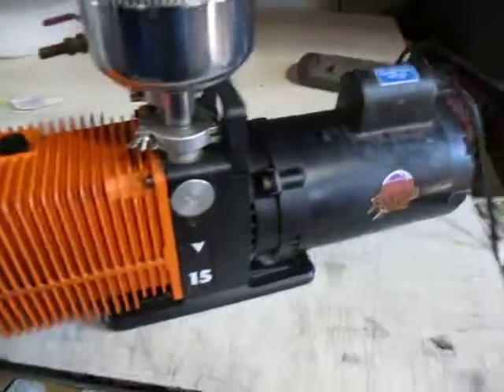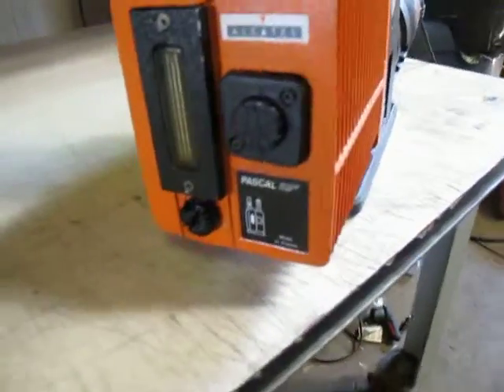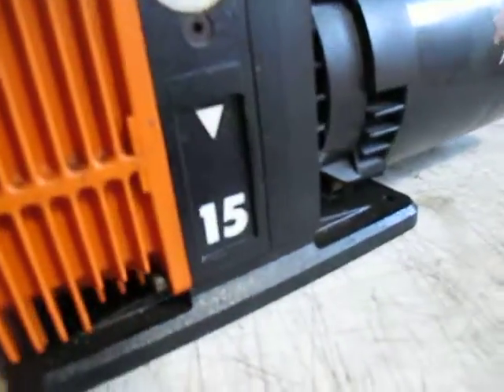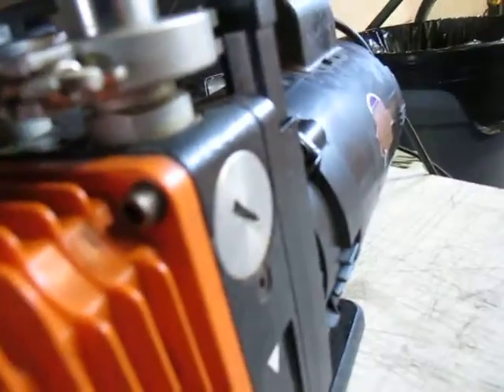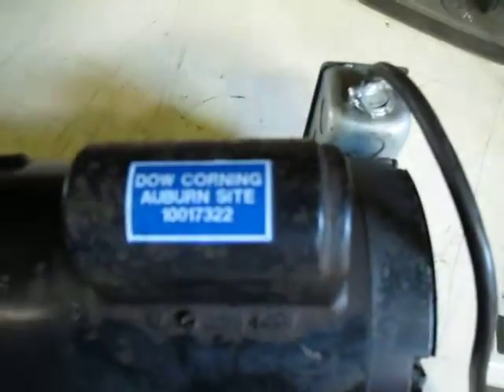This is an Alcatel Pascal vacuum pump. Model number is 15. The part number is 2015. Serial number is 250117. It's in very nice shape. It came out of a Dow Corning lab that they closed down.